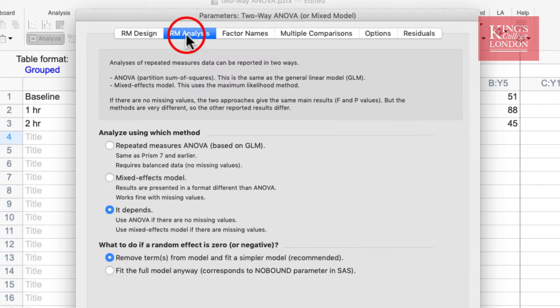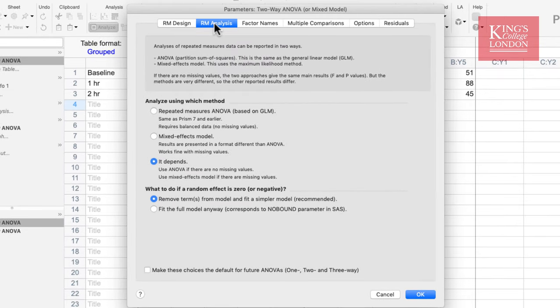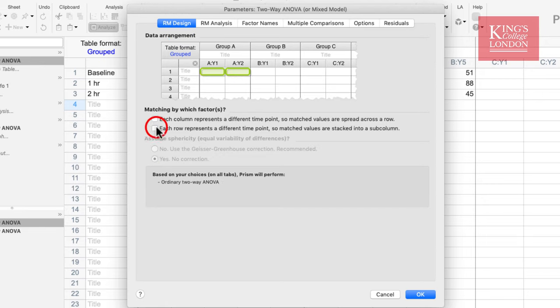The second repeated measures analysis window gives you the options of which analysis method you wish to choose: either a standard repeated measures ANOVA, a mixed effects model which allows you to use missing values, or allow Prism to decide which one to do. However, this is not a repeated measures study, so I'll deselect the repeated measures option.